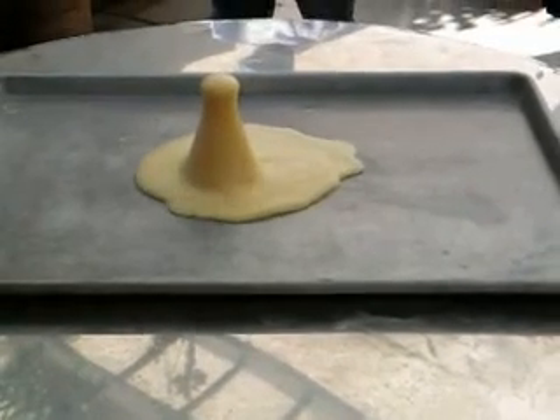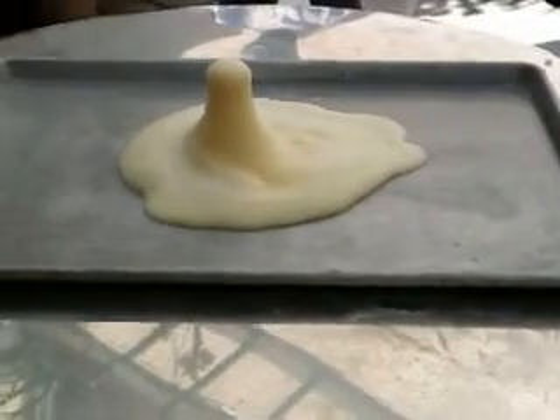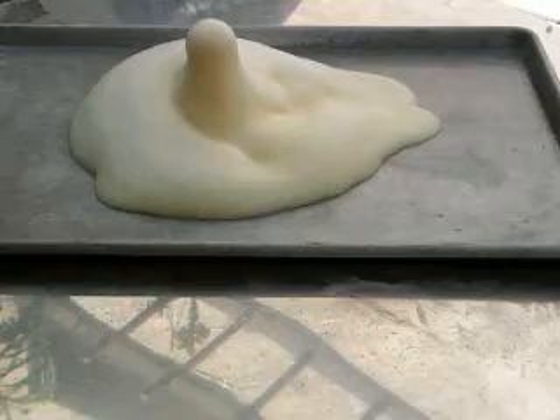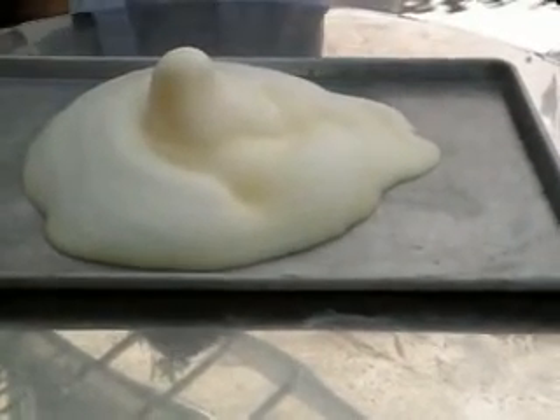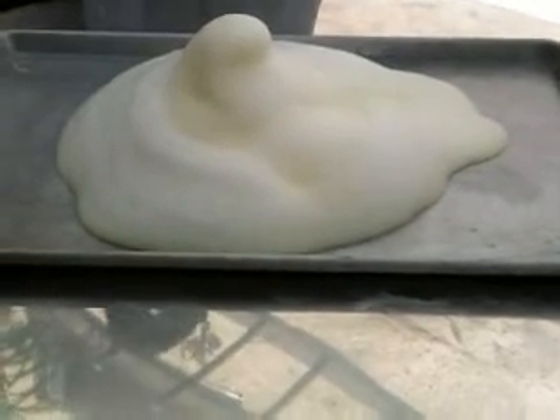And now we start the experiment. After you see the experiment, you see the pressure of the experiment is very energetic. So like you see, it pours out like a volcano.